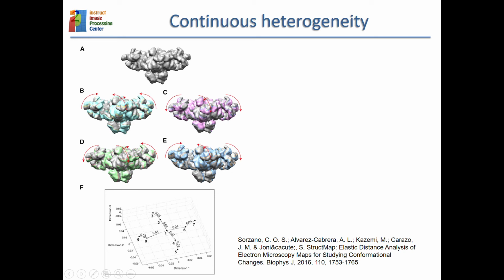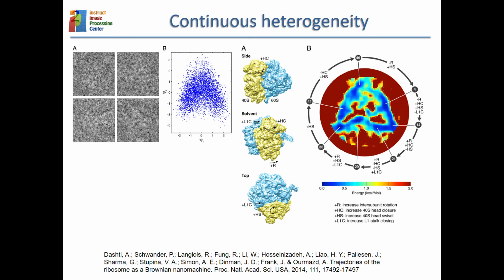And so we have two axes of movement, and that means that the relationship should be kind of a cross, and this is actually what we recovered with this tool. I have shown in this slide the examples with a phantom, because it is very nicely understood, but in the paper we applied it to real data, and we were also able to find the relative orientations or the relative sequence of all these maps.